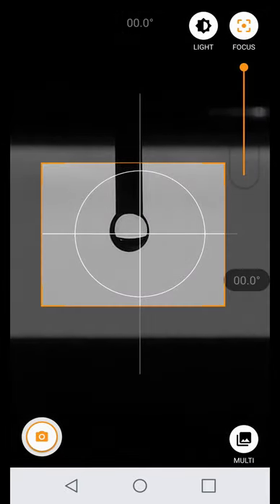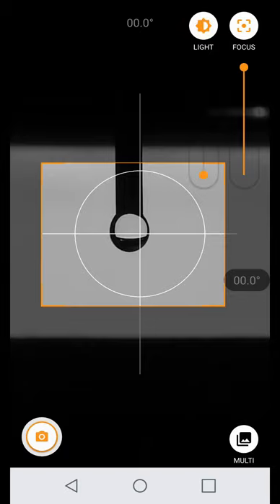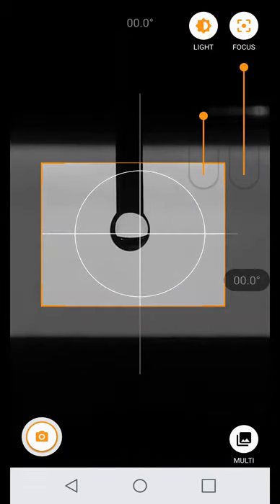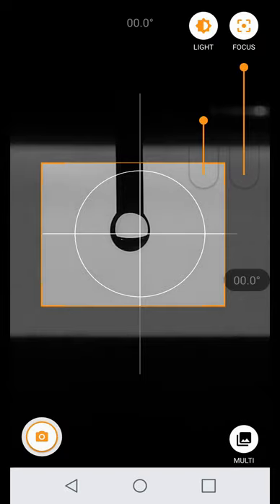Adjust the LED backlight and the phone's lighting to get the best possible contrast between the droplet and the background.